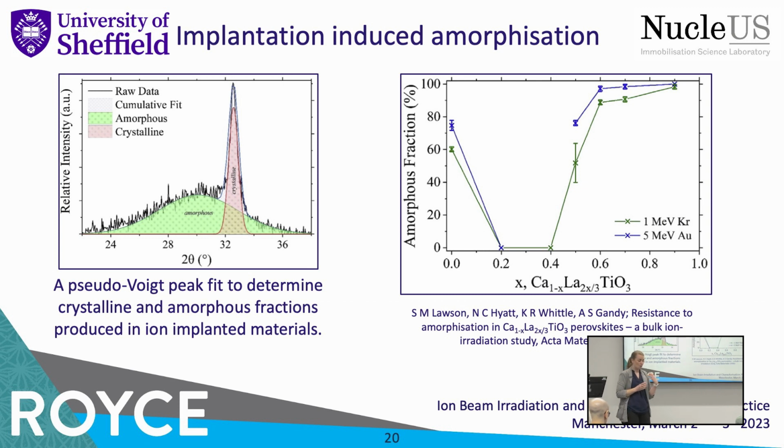So that's why Seb used the 0.5 degree angle to do all these calculations, because at that depth it's quite shallow, it's relatively just below the surface. It was 200 nanometers below the surface. So hopefully that would add some consistency into the measurement. And again, it's semi-quantitative. So that's just something to think about if you are doing these investigations.